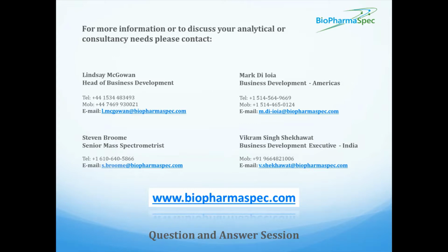Right, yeah. So, aggregation could be caused by an impurity, but it's hard for me to say whether that's the case in this particular drug product without more information. But that's certainly a possibility. Now, with regards to what different modifications could be caused by impurities, I could think of a few examples. Actually, one big concern with host cell protein analysis is checking for the presence of certain host cell proteins that have protease function. So there's certain types of host cell proteins that are actually able to digest a protein drug product, where they can clip or truncate the product sequence, and that can obviously have an impact on your drug efficacy. So that's a specific example of a modification that we might see from an impurity.